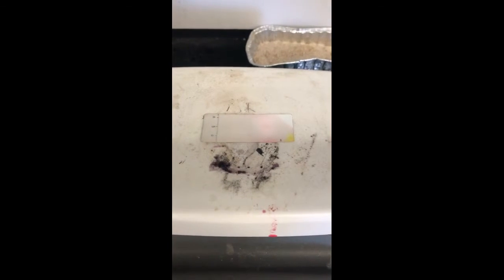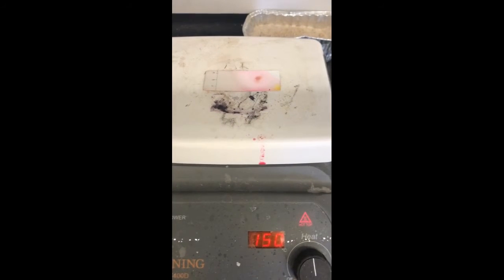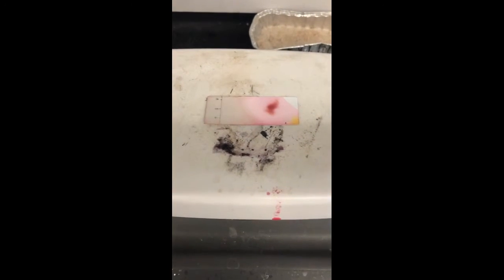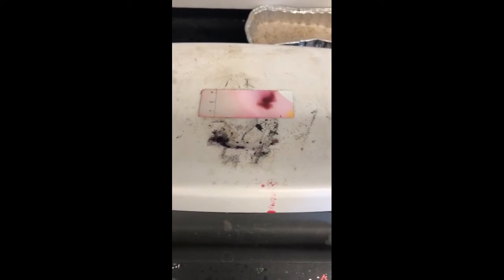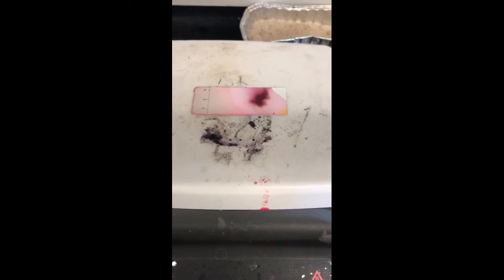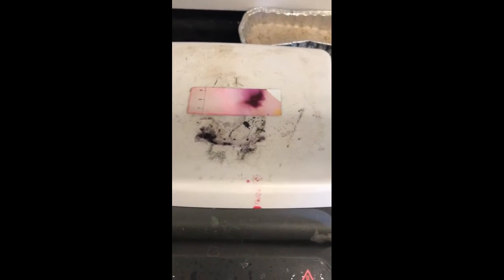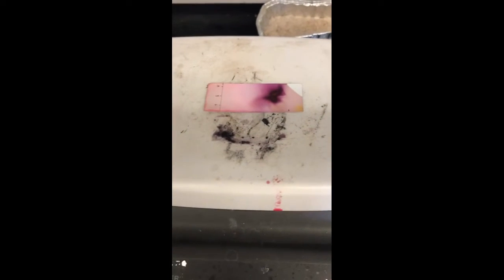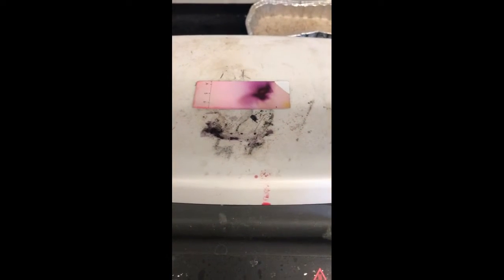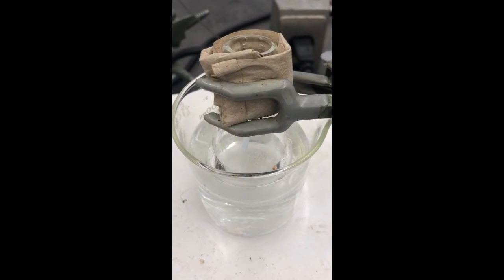After the TLC plate developed, it was then dipped in p-anisaldehyde and heated on a hot plate in a fume hood. Spots appeared after a minute of heating and the results were analyzed. After the TLC was completed, the original reaction product was cooled and 6 milliliters of water was added, followed by 3 molar HCl.